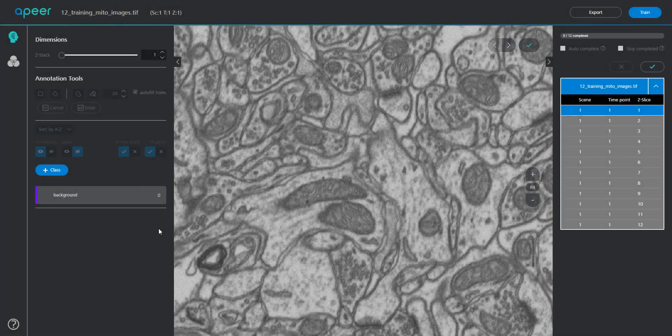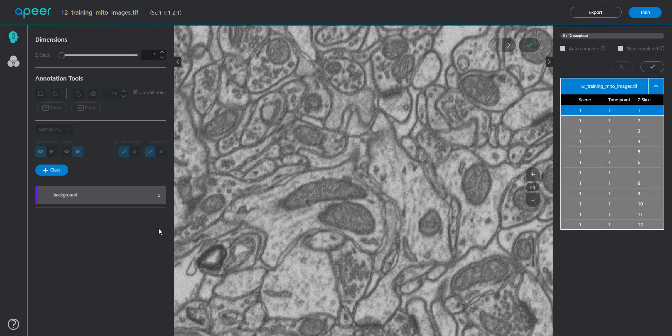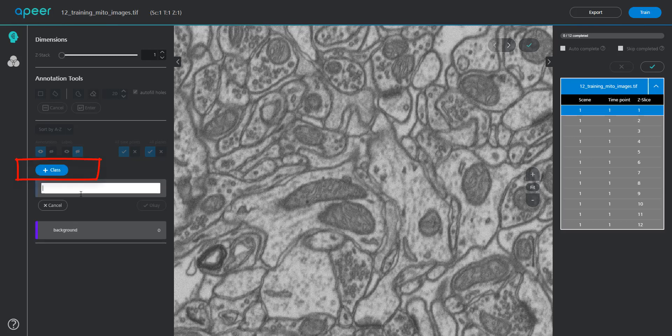This opens up your data in a web viewer with all the required annotation tools. Add the classes and name them appropriately.